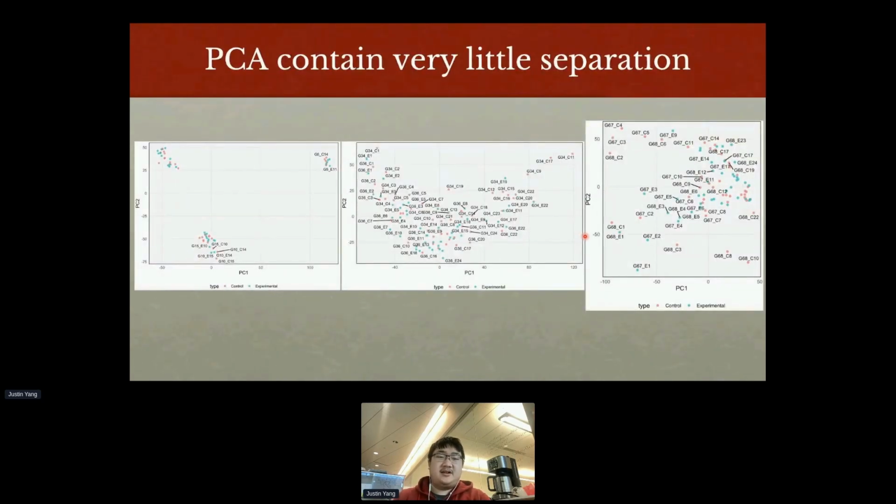Similarly, because our data has high dimensionality, or lots of different columns, we conducted PCA analysis for the 3 data sets we mainly focused on, those being generations 1, 5, 10, 15, and 45 on the left, generations 34 and 36 in the middle, and generations 67 and 68 on the right.